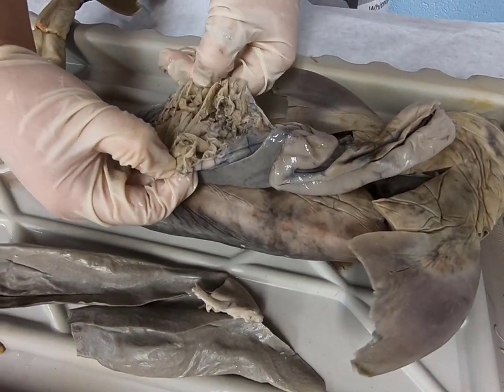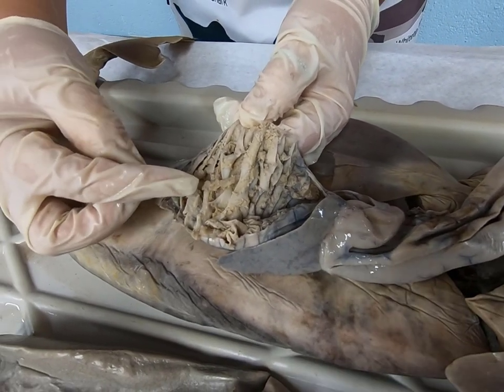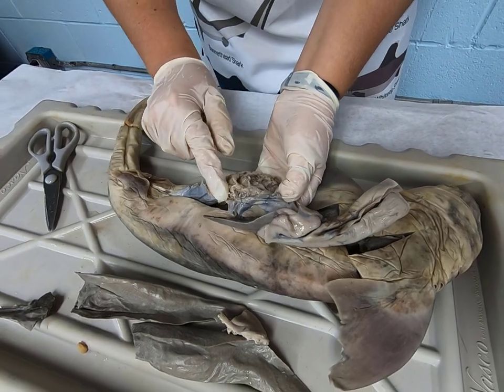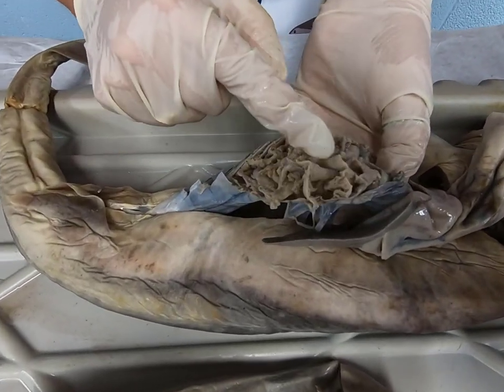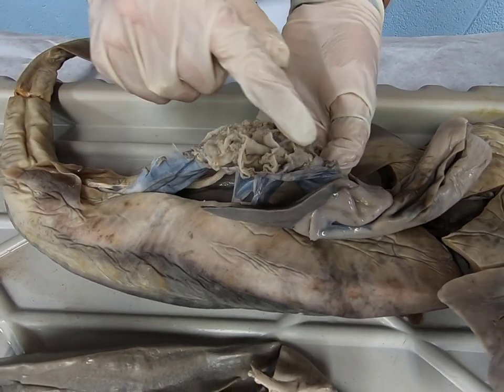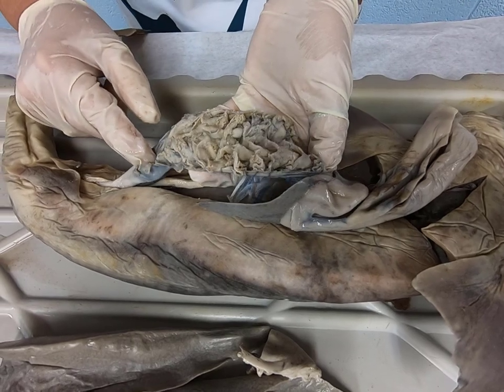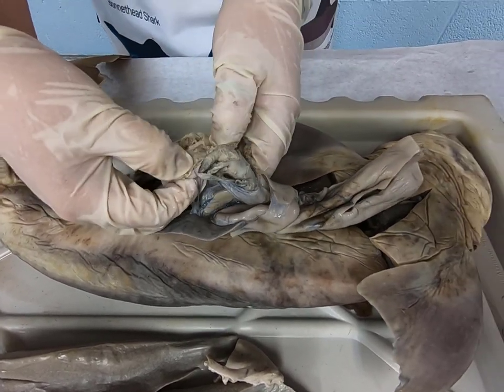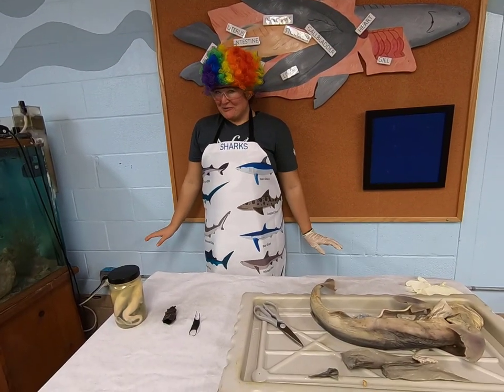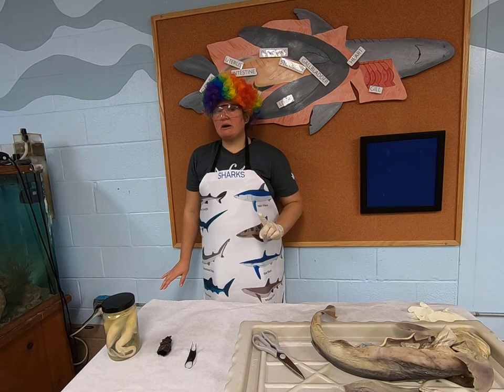So inside of this spiral valve, we have a delicious and nutritious surprise. You see all these layers and all that goop in between? That's actually shark poop. So how scientific and interesting is that? All these layers allow for absorption of nutrients until you expel it from the body. So we have all this room for nutrient absorption through the body. So delicious and nutritious. And that spiral valve helps to slow it down so it has enough time to move all the way through the body. So we do have a female shark, and we're gonna get to see if she actually has some babies. But first let's learn about shark reproduction.